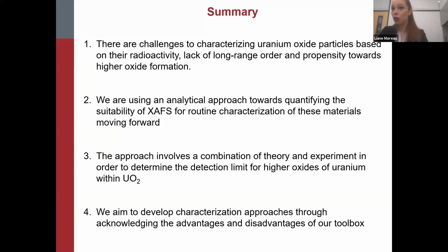And this is a test system, I should mention, but I imagine there are many different systems within the community that could benefit from knowing the realm of thresholds that we might see. We are very invested in uranium oxides, which is why we are exploring this with uranium oxides. And a last item is that we aim to develop characterization approaches based on acknowledging the advantages and disadvantages that our toolbox has. So we really would like to be able to say with what degree of statistical evidence we are confident in the results that we are reporting.